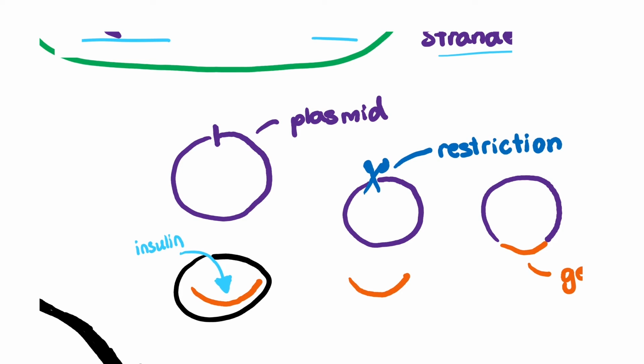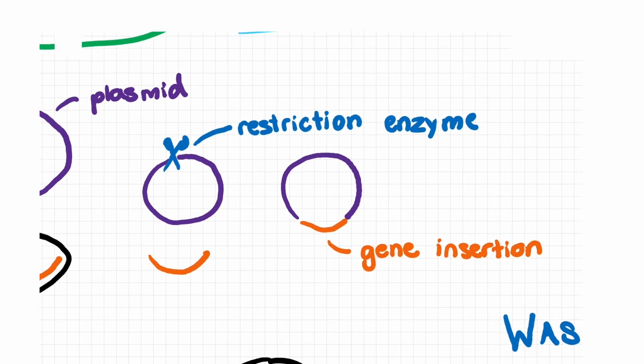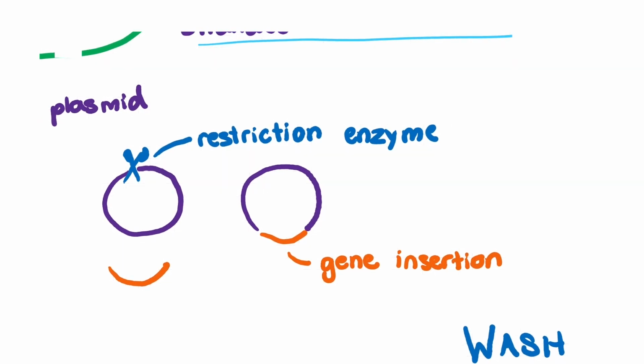So let's say we have our plasmid and insulin. We can use a restriction enzyme, which I'll be going over in another video, to cut our plasmid and insert this gene. And then you can effectively have a plasmid to produce insulin. And we can then insert it into other bacteria and have bacteria produce insulin for us, allowing us to produce this protein for diabetic patients. Well, mini-preps are key parts of this process because mini-preps allow us to replicate this plasmid rapidly.